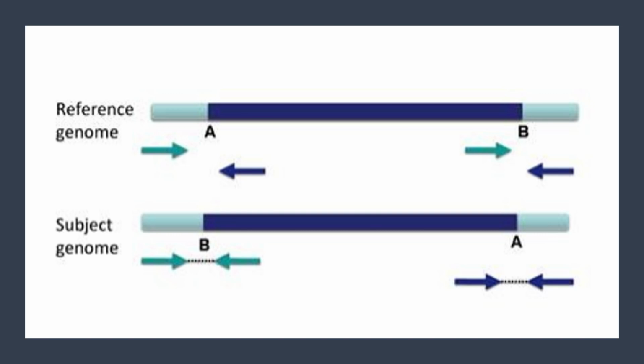Because the segment in purple is flipped from the reference genome, when aligned to the reference genome, the arrows from the purple regions will get split up and flipped around, as indicated in the upper image. When paired reads get split and flipped like this during alignment, it is indicative of an inversion.